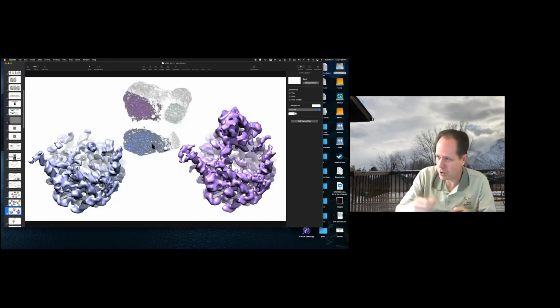They should be discrete. You have to be a little careful also when you're looking at these 2D spaces. The energy space that we deconvolved the data into here was actually a 4-dimensional space, and then we used additional dimensional reduction methods to bring it down to 2 dimensions. The dimensional reduction method often does funny nonlinear things as well. In fact, I think this one was nonlinear. So the fact that you see a big barrier here, it may not have been the same if you looked at the actual 4-dimensional space. So you have to be a little careful about that sort of stuff as well.